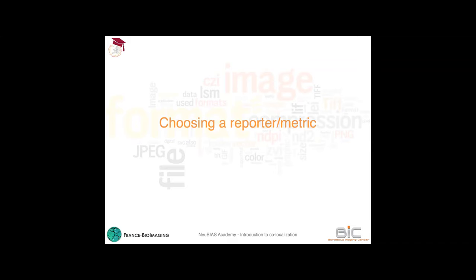Another interesting question, actually quite frequent, is about how to use controls. Some people drop thresholds and so on. I guess that's what you will cover in the next minutes, so maybe it's not necessary to talk much about it. But there is one question that I think is really interesting: what do you do with your control images? Do you have to show them, for example, in your manuscript?